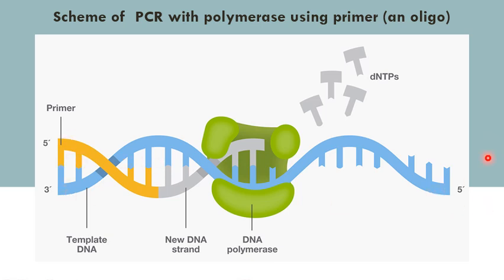So you specify the whole piece of DNA you need to amplify. You need a forward primer and a reverse one, and you need some DNA polymerase and the building blocks, which are the dNTPs. According to what you design, you will get the amplification products, or the newly synthesized DNA strands.